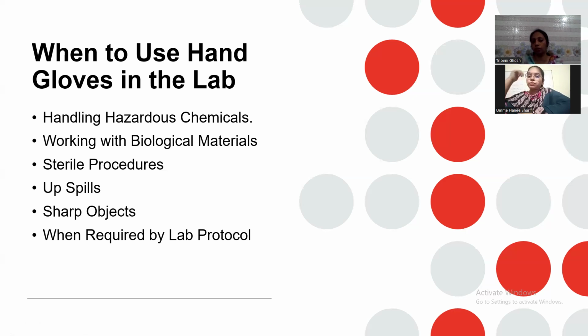So we must wear gloves when working with biological materials, to maintain sterile procedure. Maintaining sterile conditions during our experiment is very crucial, so we must wear hand gloves.